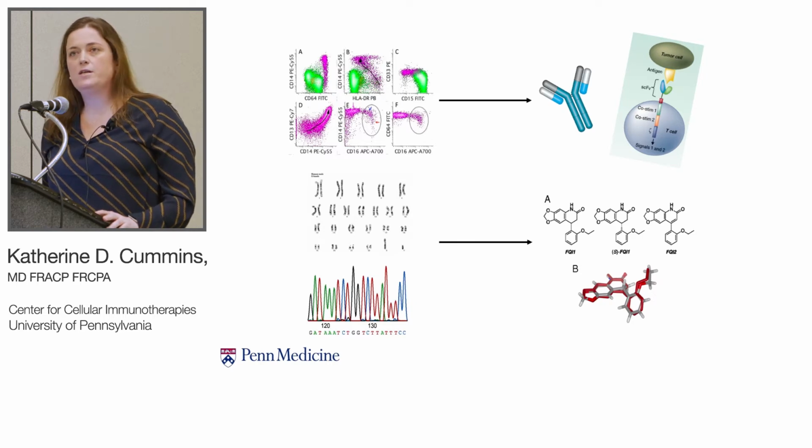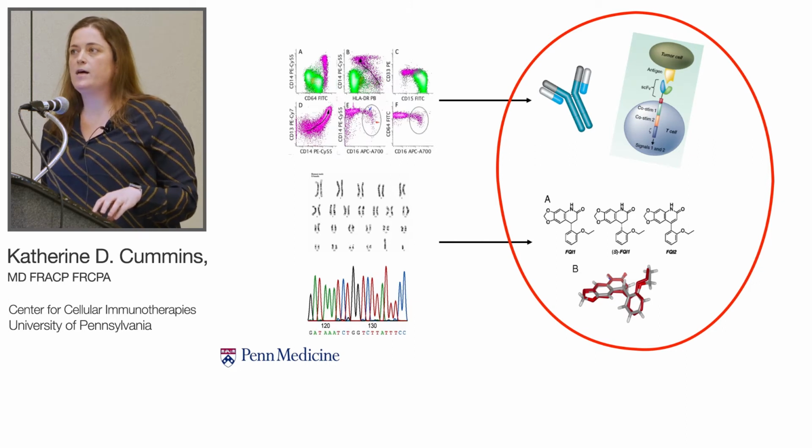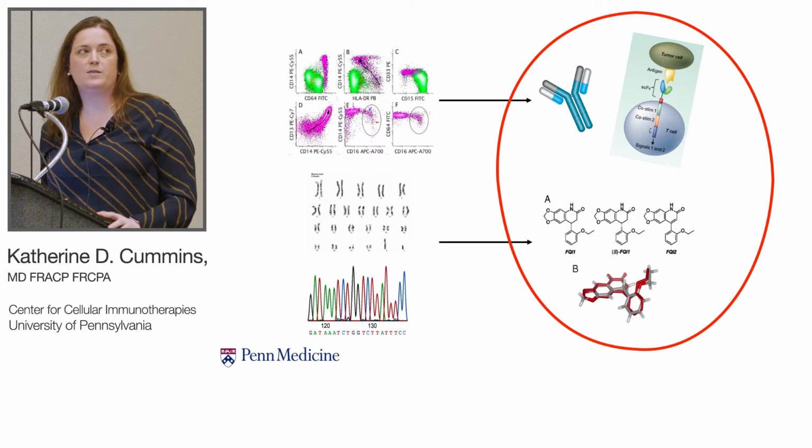And what we're interested in understanding from this DNA and protein sequencing technology is, can we actually combine these, and can we get more accurate information about what is actually the underlying driver of the cell, how that correlates with phenotype, and how we can best treat and also monitor these patients.